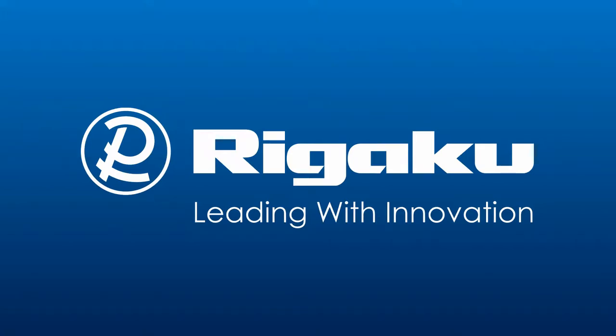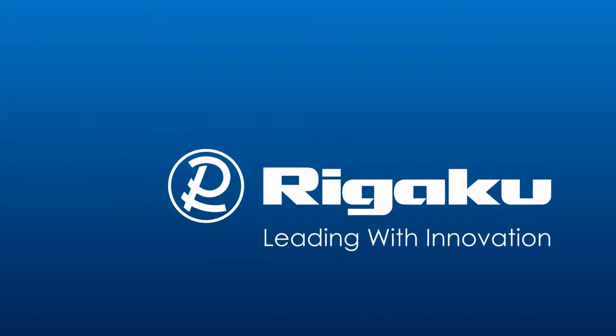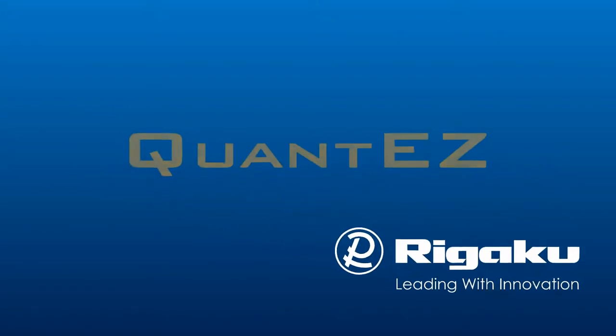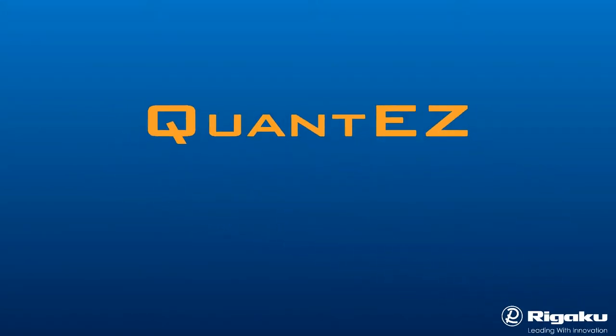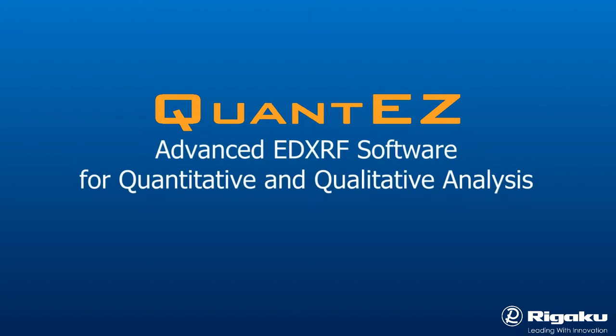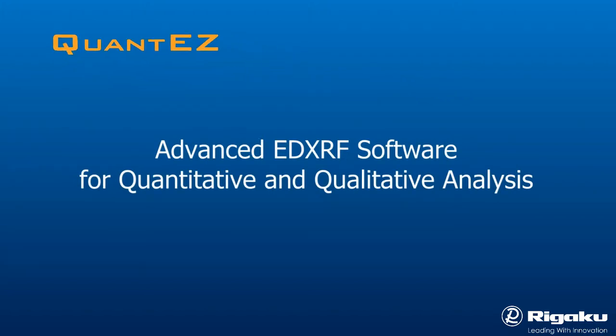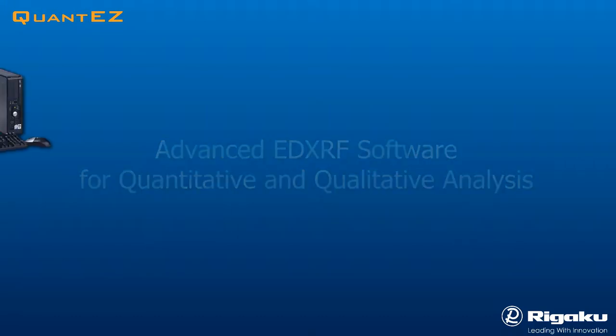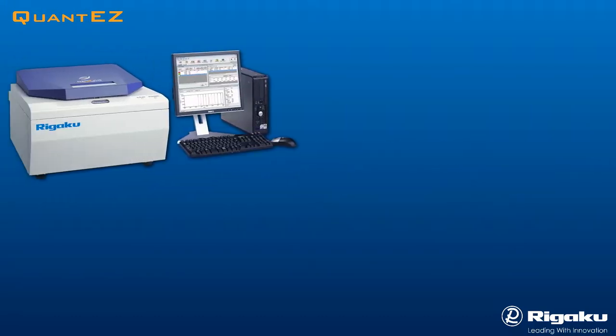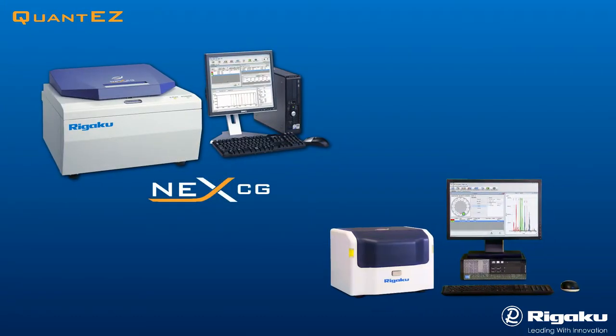Rigaku, the leading X-ray analytical instrumentation company, offers QuantEZ advanced EDXRF analytical software with the NexCG, NexDE, and NexQC QuantEZ instruments.